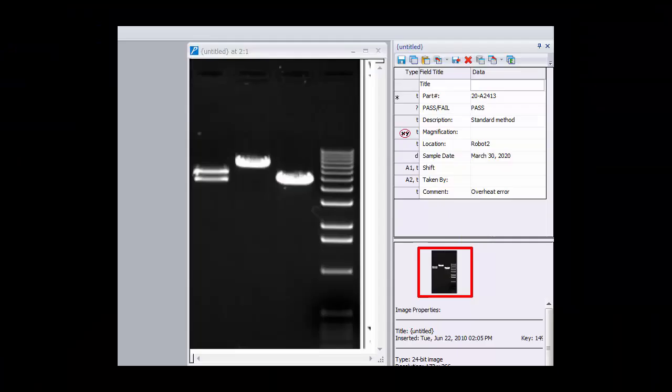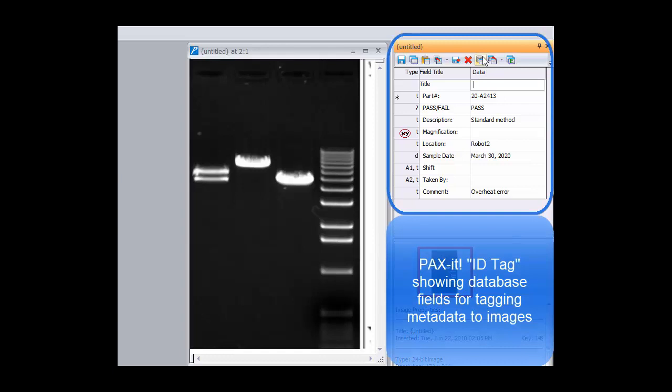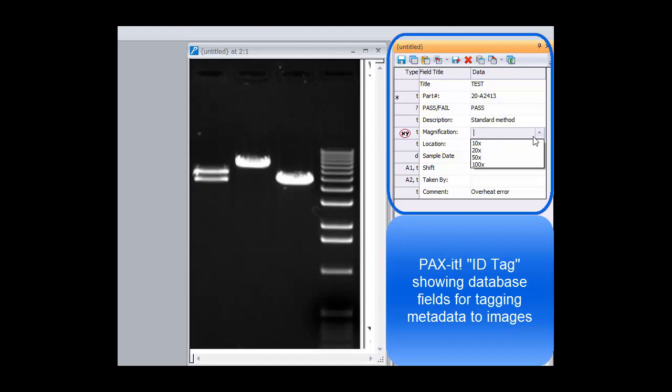Hello and welcome to this Paxit instructional video. Paxit software is a powerful image database that allows tagging important information to images as metadata housed in database fields.